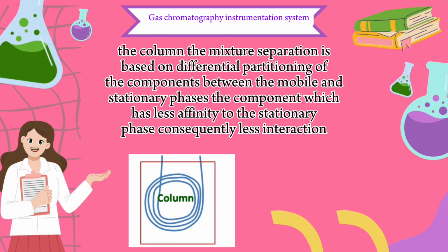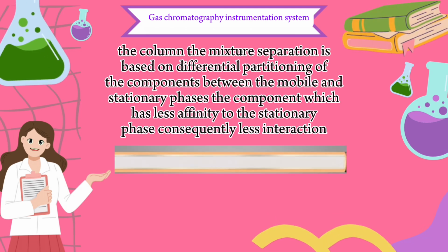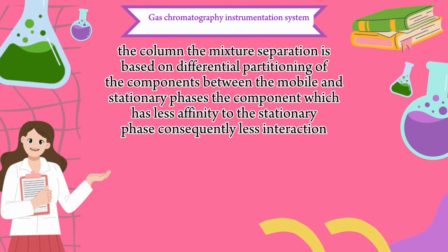In the column, the mixture separation is based on differential partitioning of the components between the mobile and stationary phases. The component which has less affinity to the stationary phase has consequently less interaction.